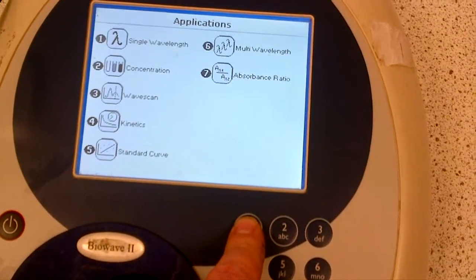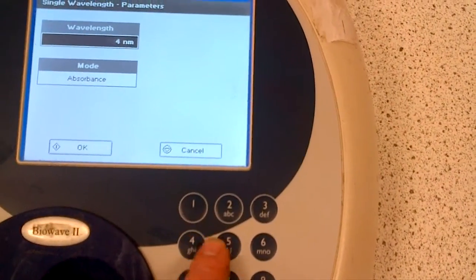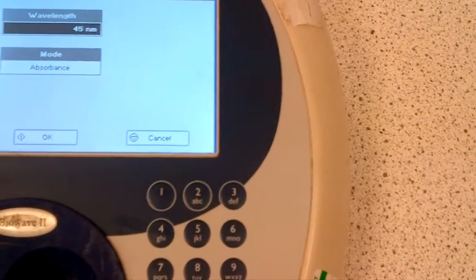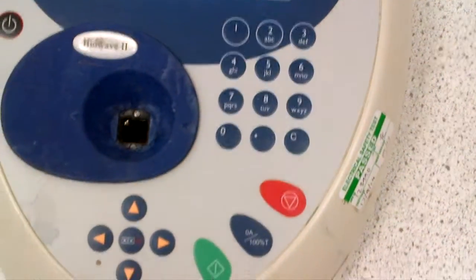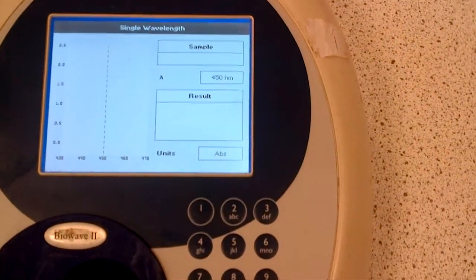So we press 1 on this keypad. If we're happy with a wavelength of 450, we can keep 450 in place. So put 450 and then press the green button, which represents OK. Press green for OK and we're now set to a wavelength.